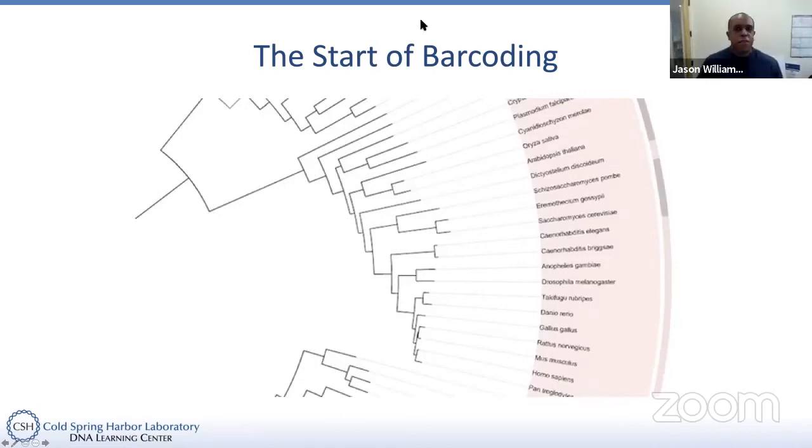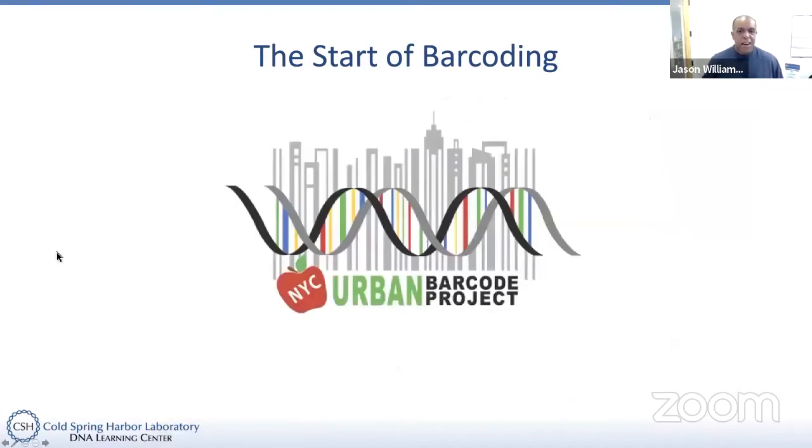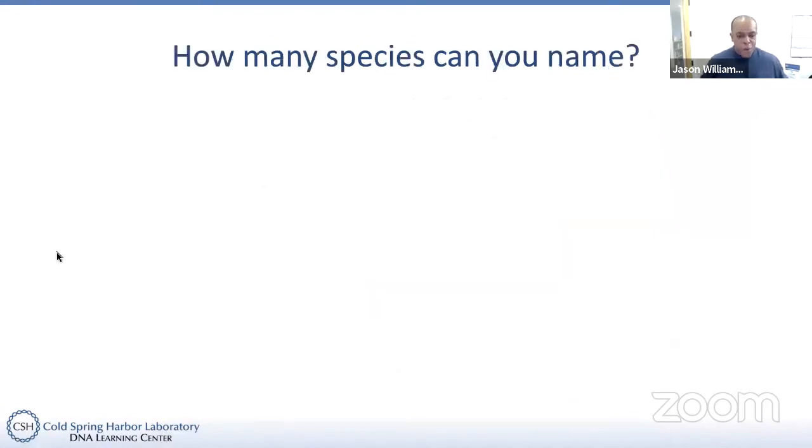Okay, so let me just adjust something here. Get my lighting back to where it's a little bit better. So in that video, what you were seeing was just a description, again, of the start of DNA barcoding by Mark Stoeckle. And where we are with this today is really to the point at which we can use it in the classroom.